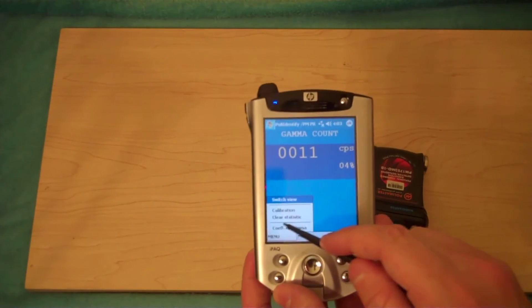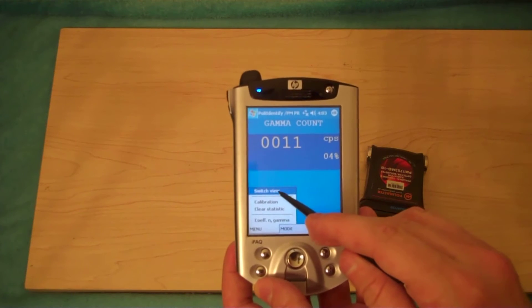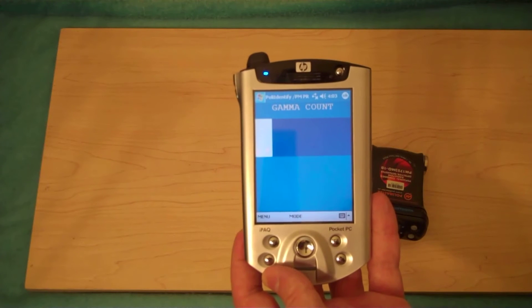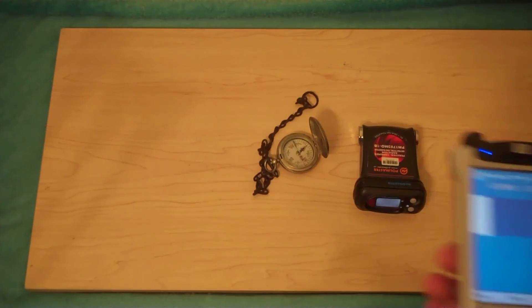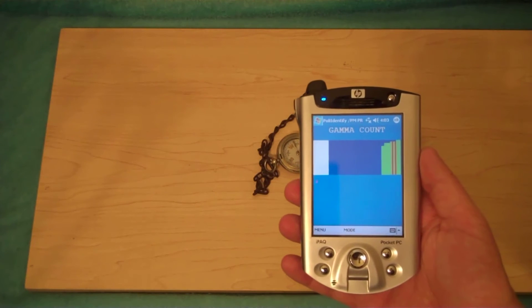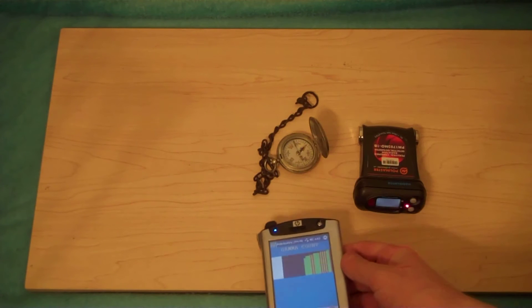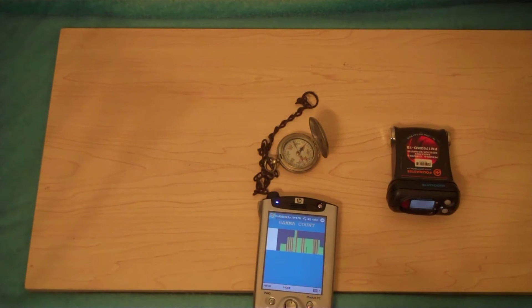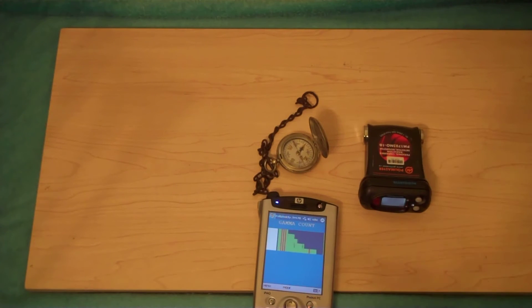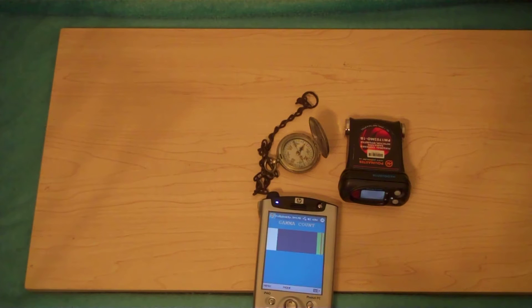Now we can change to a pictorial view. As radiation is exposed to the unit, we can see in an auto-scaling mode what that looks like. Here is a World War I military radium compass, and as you can see the gamma rays start flowing. We move away and they lower. We push the unit back and they rise again. This is auto-scaling so you have to give it a few seconds to catch up. Now we're auto-scaling and you can see.